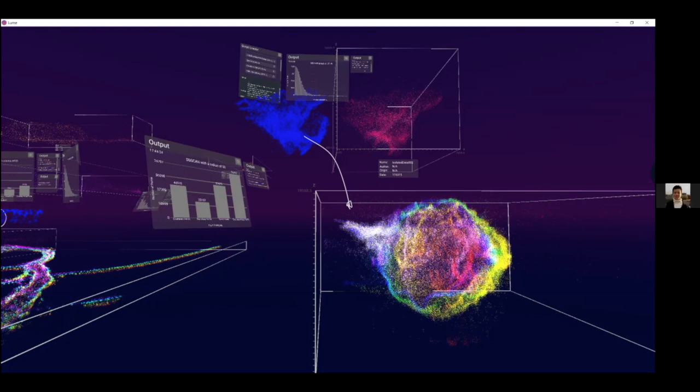Fantastic. Thank you all so much. Alex and Stephen, this is revolutionary, and you've been so kind to share it with us. We're hoping to promote it out to all the researchers we are in contact with, because I think you're at the beginning of something just huge, and it's a great tool. And I think it could really provide a lot of new insight into T cells, beta cells, many cells. So thank you so much for sharing your time and showing us the demo today. I really appreciate it.